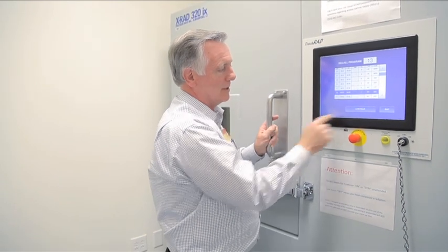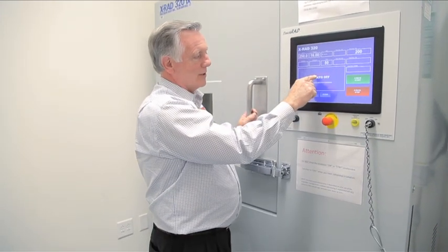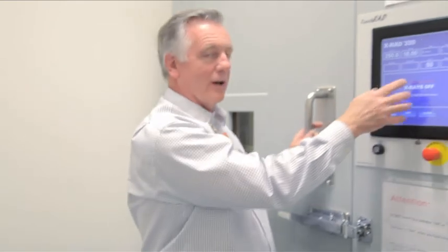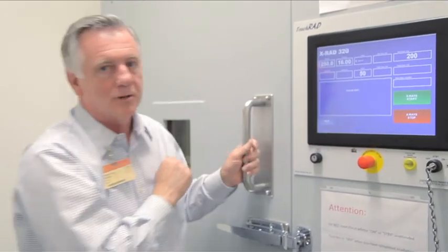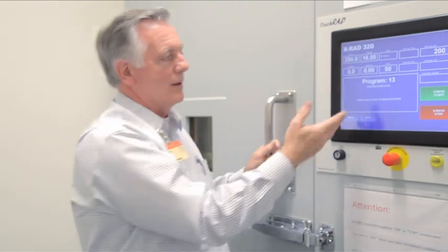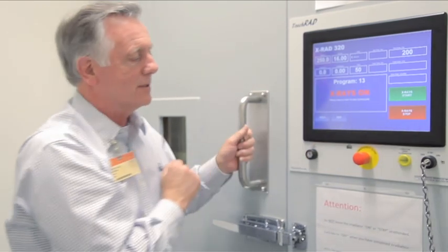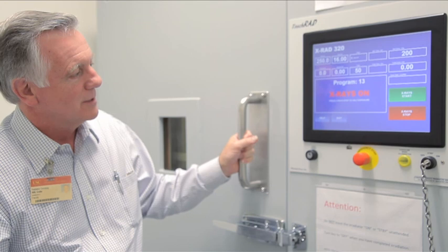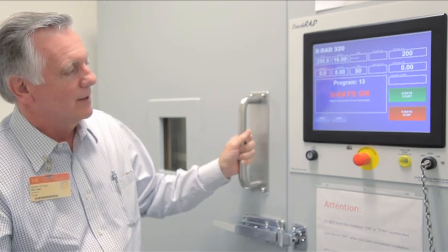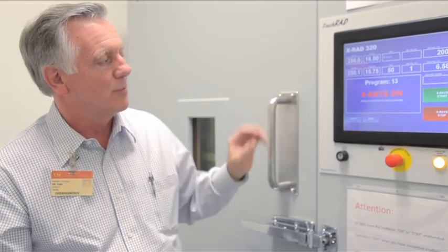This is 250 kVp, which is the standard that most people are using. Because the door was open, it shows an error — door control open. You clear that, and then it compiles the dose for that particular program. When it shows the program is ready and you're sure everything is set up correctly, you press start. After clearing any errors, you press start again and this time it stays on, and you should see the appropriate dose increase.